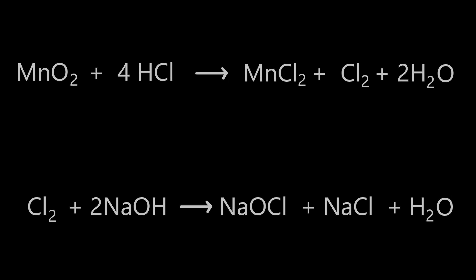We're starting from manganese-4 oxide, or manganese dioxide, reacting it with hydrochloric acid. The hydrochloric acid reduces manganese-4 to manganese-2, forming manganese-2 chloride, and oxidizes chloride ions to chlorine.